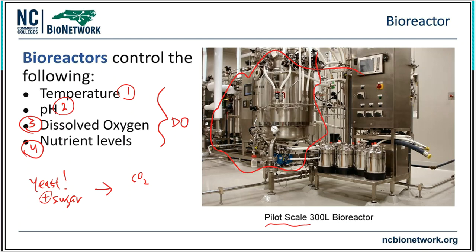All right, well, imagine this big stainless steel container right here, completely sealed off. No leaks. And that yeast is going to generate CO2 gas. What's going to happen to the pressure? It's going to go up, up, up, and before you know it, there she blows. So I need to constantly monitor the pressure, because CO2 or other types of gases can be given off, and I need to vent those out in some form or fashion to prevent an explosion inside of the environment.